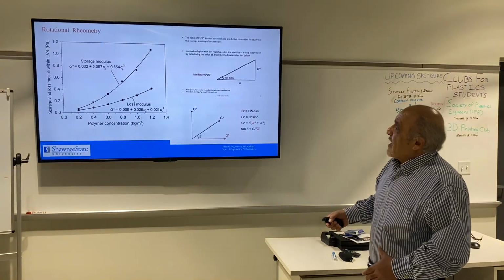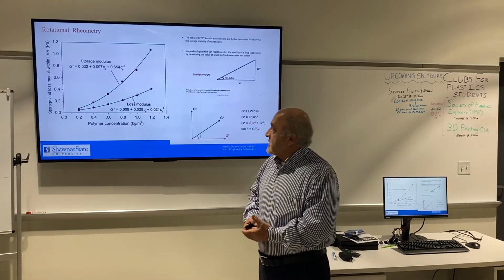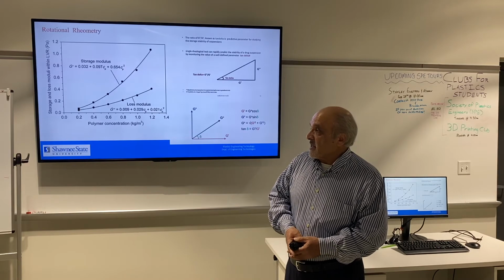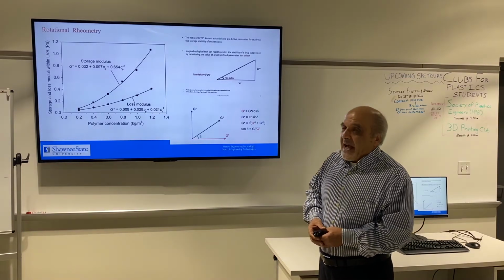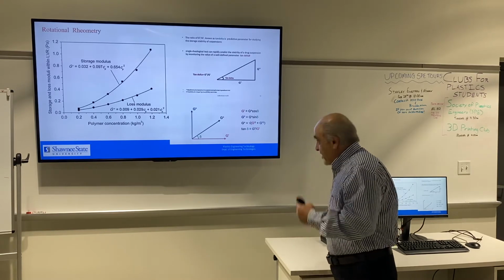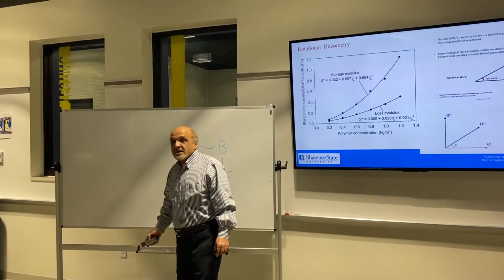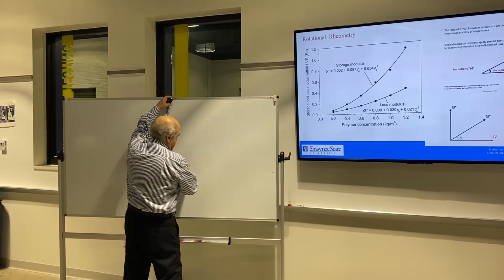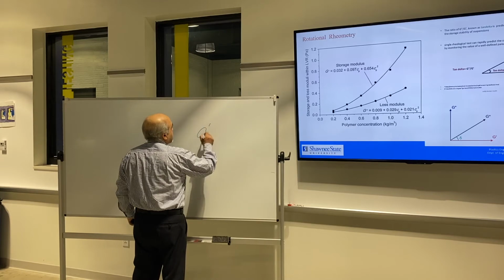And there is the last one that I would like to say. This is the last slide regarding dynamic polymer melt testing. We have two concepts here: one is the storage modulus, and one is the loss modulus. As I mentioned in class, we are dealing with viscoelastic material. So the storage modulus is related to the elastic part. The storage modulus G' is related to the elastic part.